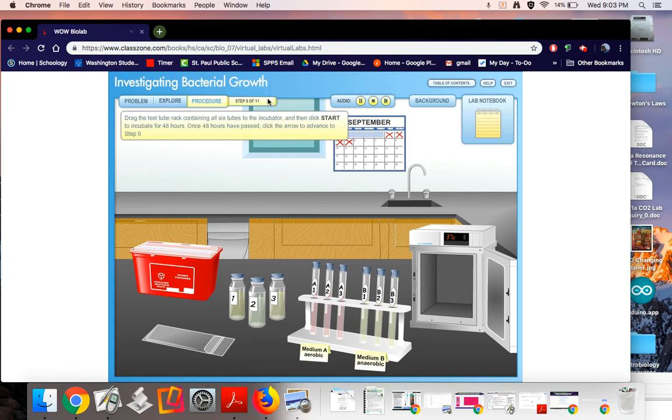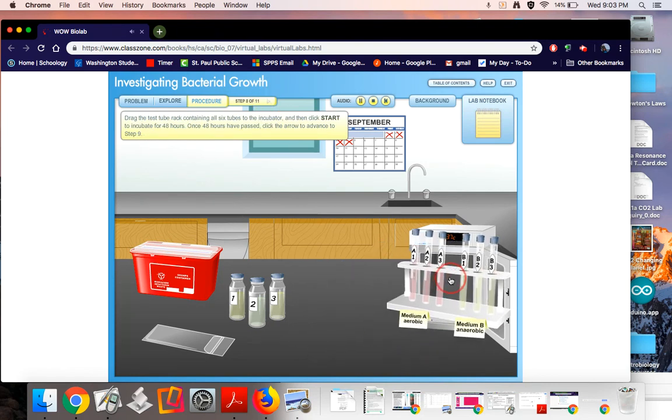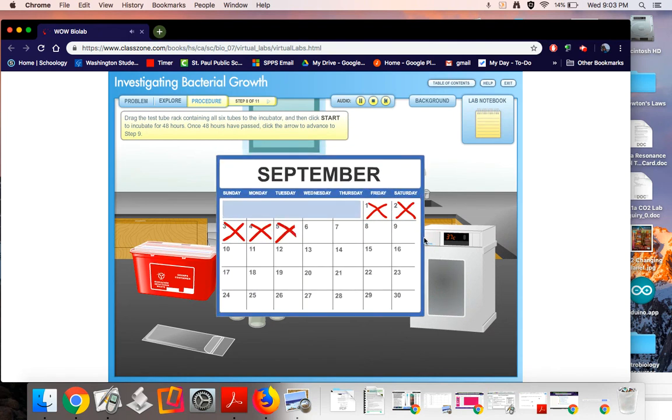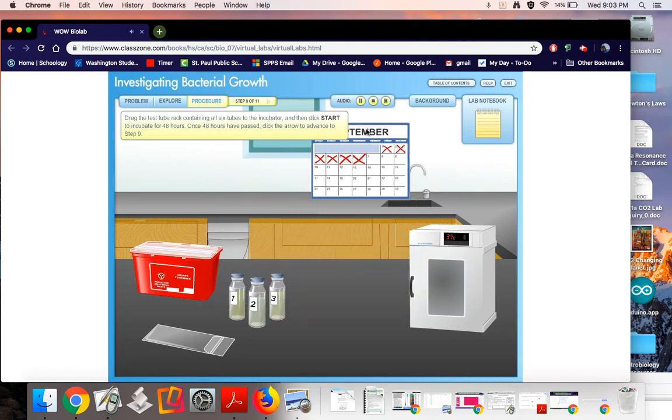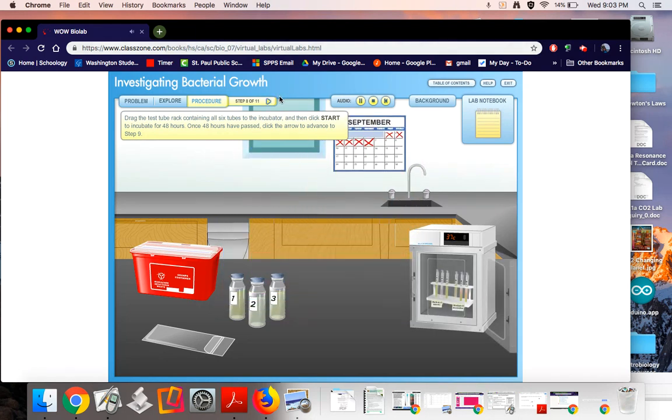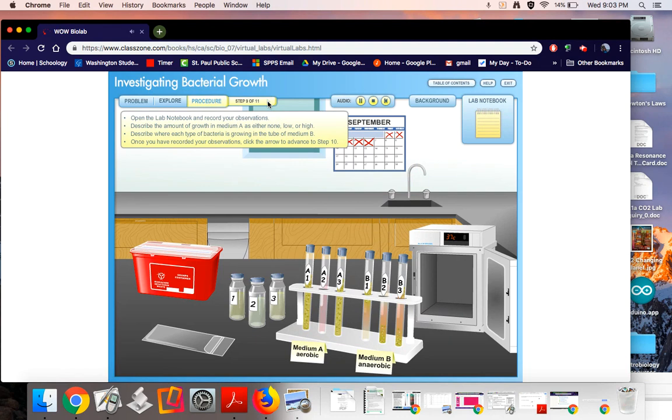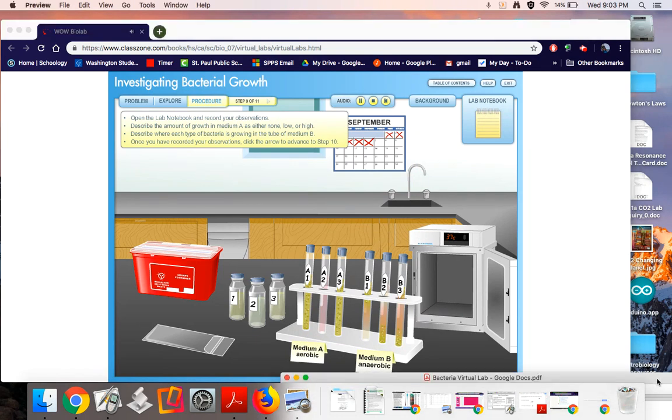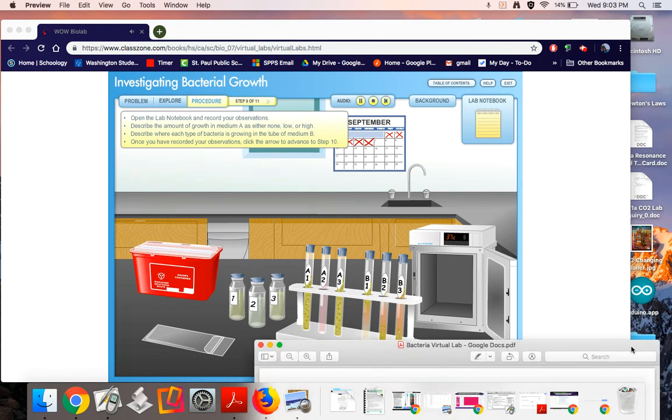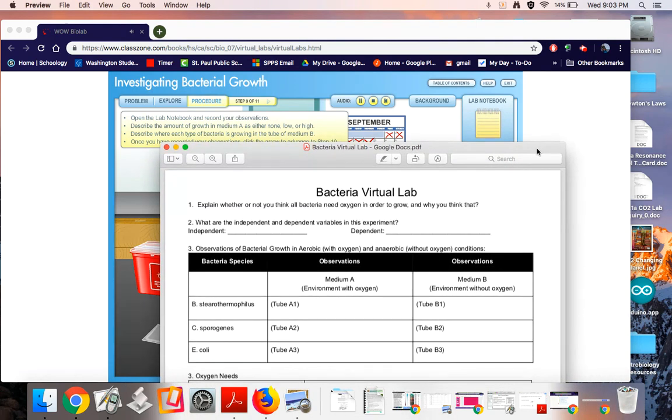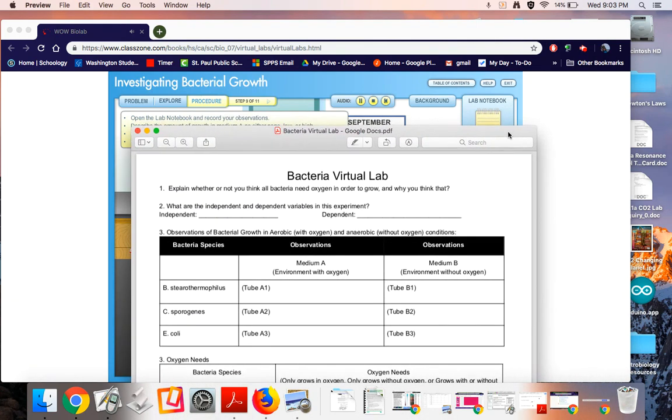Drag the test tube rack containing all six tubes to the incubator and then click start to incubate for 48 hours. Once 48 hours have passed, click the arrow to advance to step nine. Open the lab notebook and record your observations. Describe the amount of growth in medium A as either none, low, or high. Describe where each type of bacteria is growing in the tube of medium B. Once you have recorded your observations, click the arrow to advance to step 10.